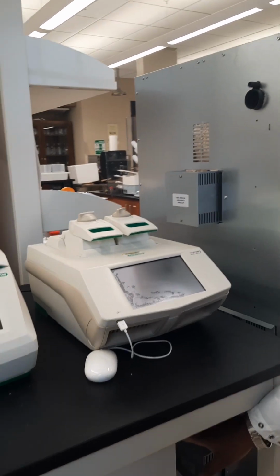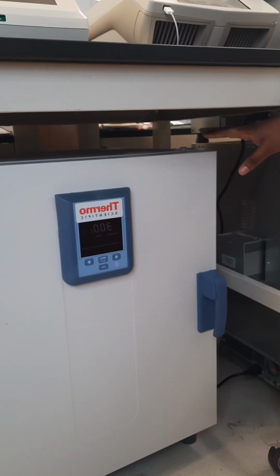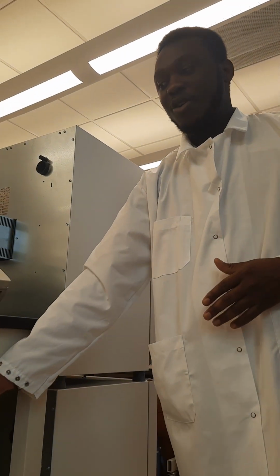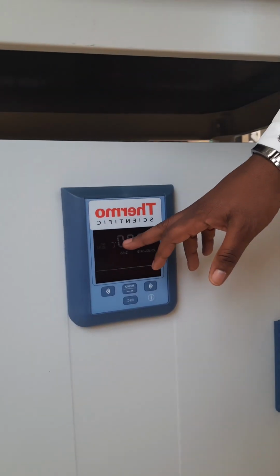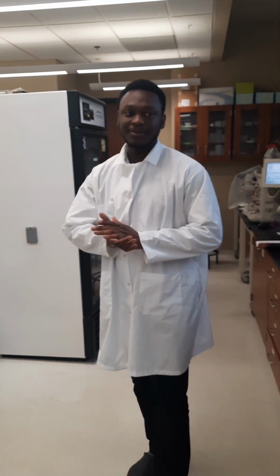And this is also a PCR machine. This is what we call the incubator, and basically what it does is to grow our organism. For example, I work on an organism called Streptomyces hygroscopicus, and it usually grows at 30 degrees Celsius. So that is why you have the temperature set here at 30 degrees Celsius.